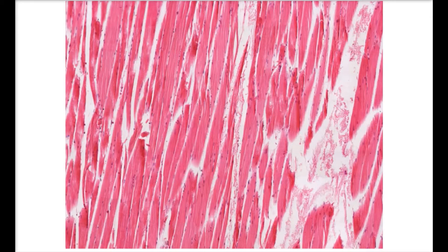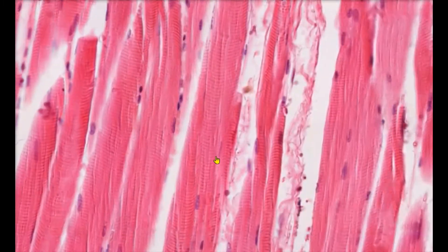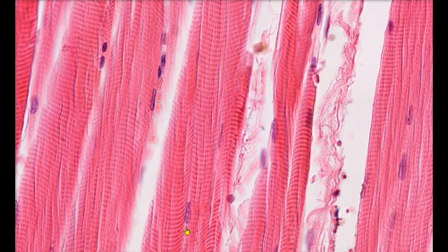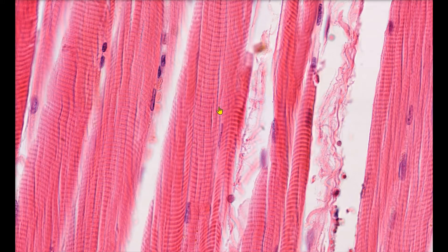Let's zoom in so we can get a better look at the cells that make up skeletal muscle tissue. Notice how the cells are long and cylindrical. Multiple nuclei can be found along the edges of each cell. We can also see these alternating bands of light and dark sections. We refer to these alternating bands as striations. This striated appearance is due to the repeating sarcomeres of the myofibrils inside the muscle cell.